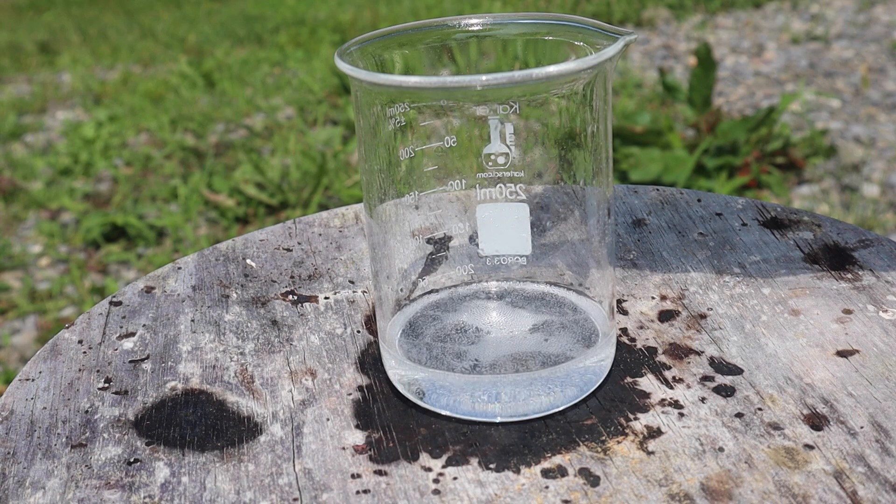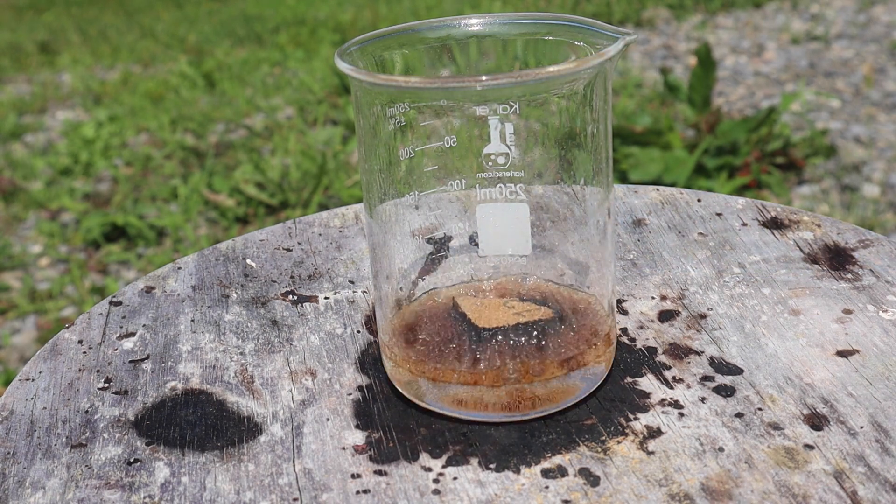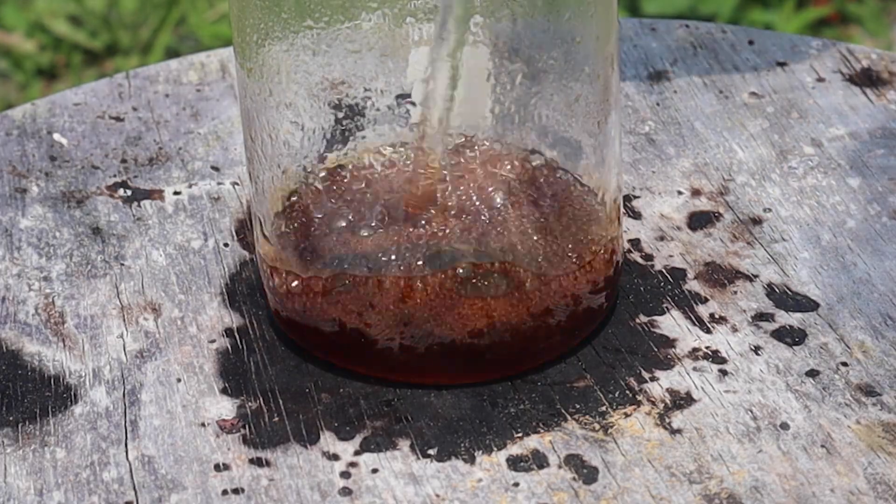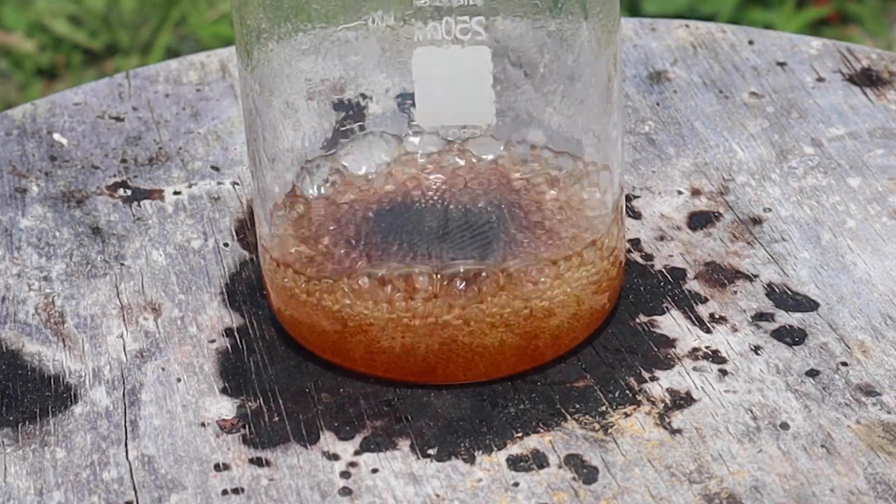I added a piece of wood, which was the only thing that didn't completely dissolve. It just turned into like a condensed black block — it sort of looks like it just turned into straight carbon.